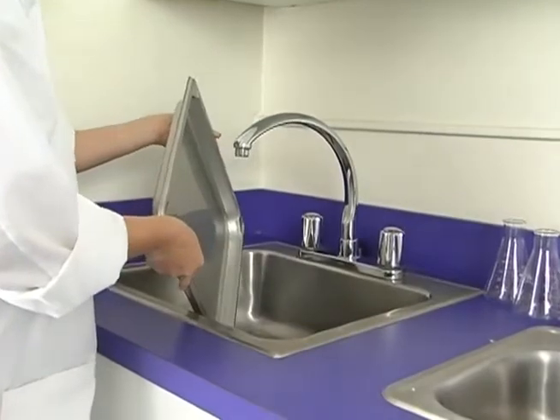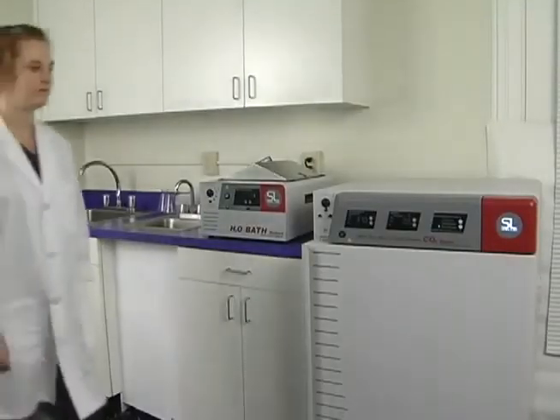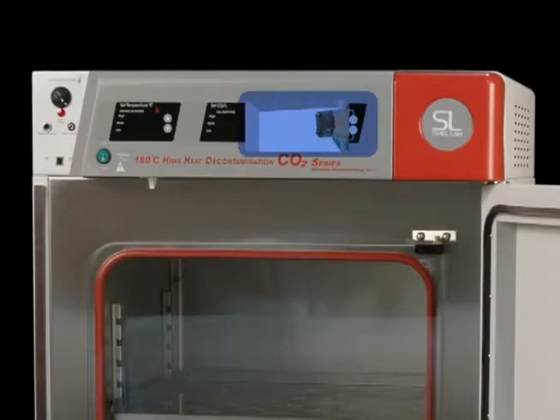The entire shelving assembly can remain inside the unit, and we have engineered the Shell Lab 3552 so that the IR sensor does not have to be removed, as it is located outside of the incubator chamber and shielded from the 180 degree temperatures within the chamber.